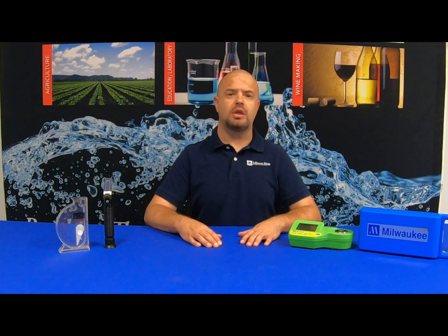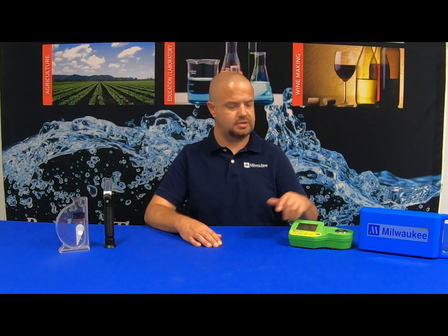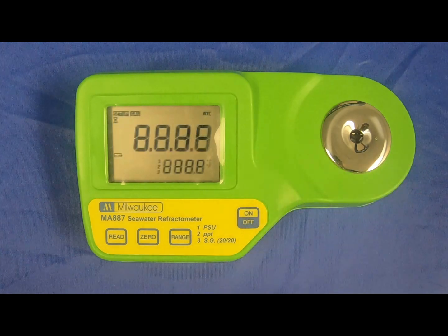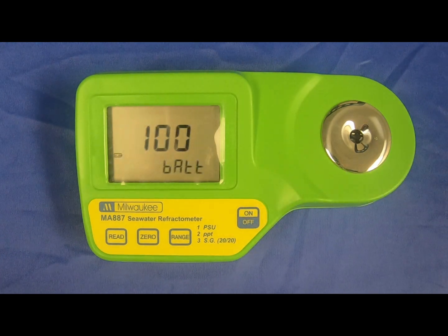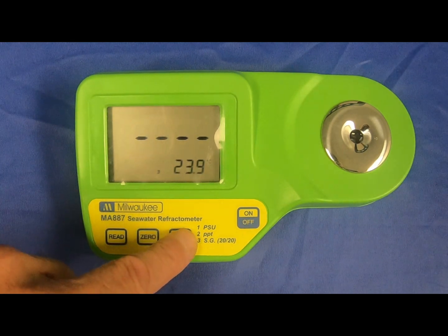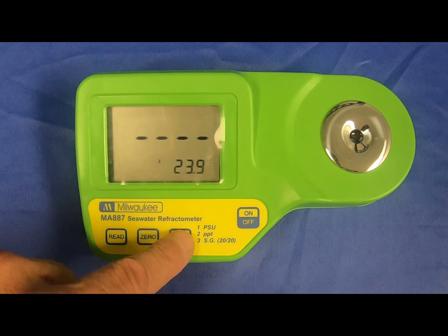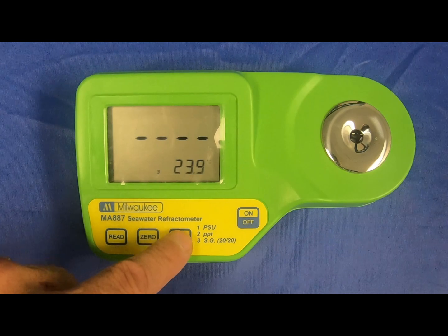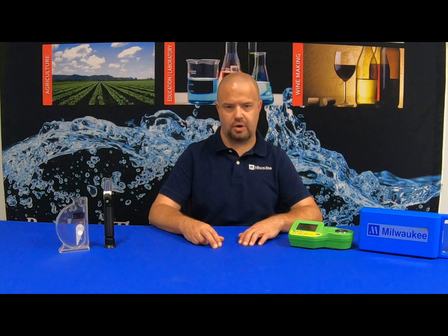To power up the Milwaukee Instruments MA-887 digital seawater refractometer, simply hit the on/off button. It's going to show you your battery percentage and it's going to start out in PSU. To select through the various ranges, hit the range button — you can go from PSU to PPT to specific gravity. In today's video, we'll be measuring in specific gravity.